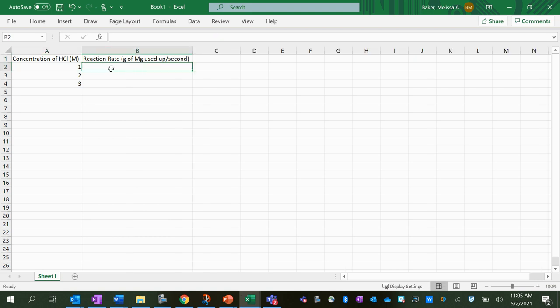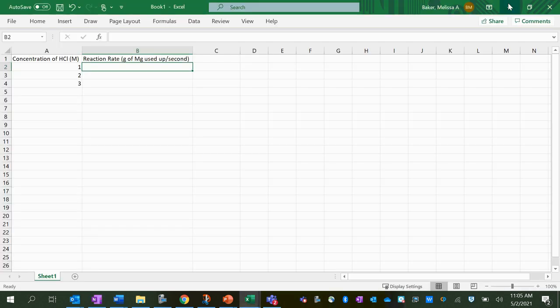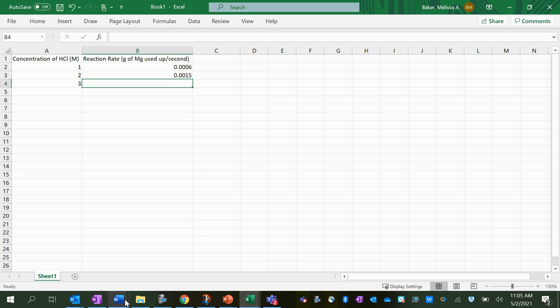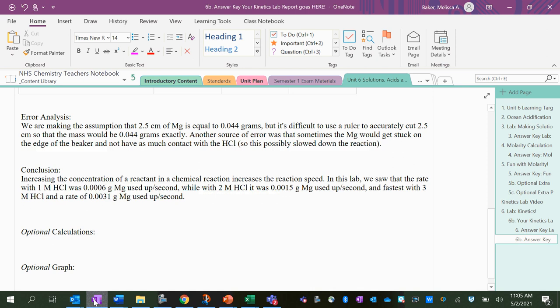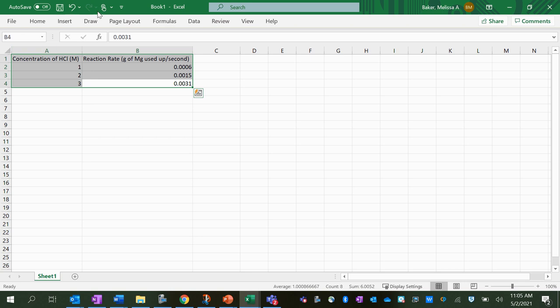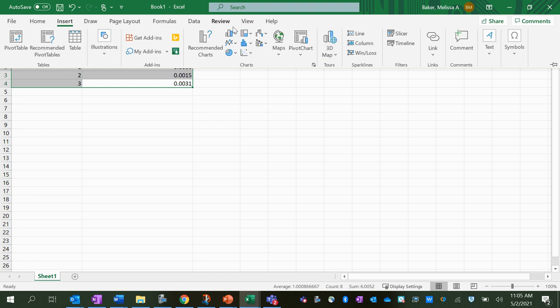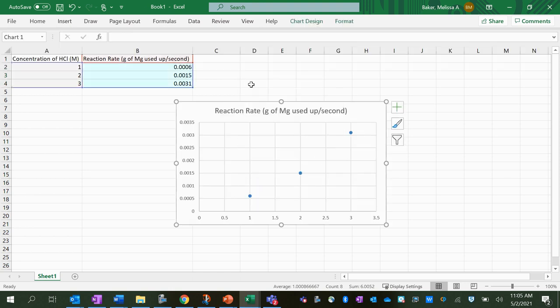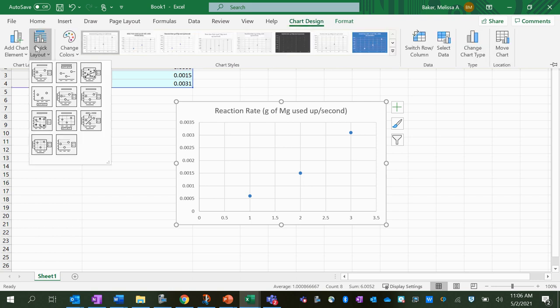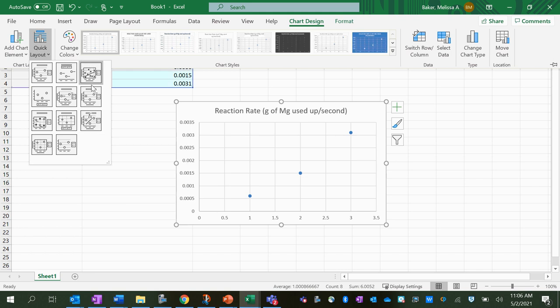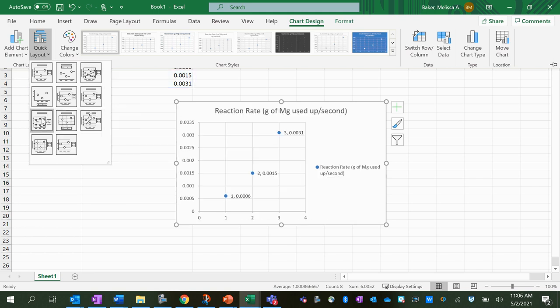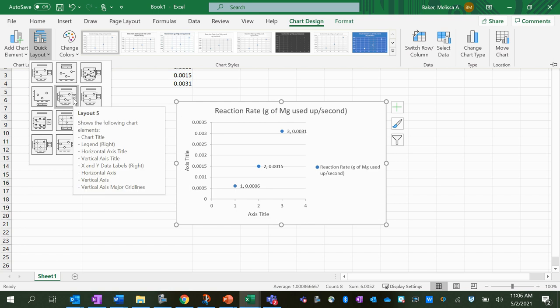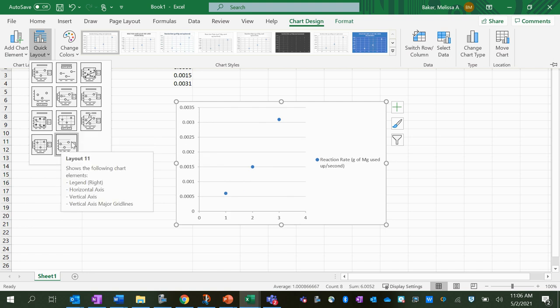And what were these numbers here? Let's see, 0.0006, this was 0.0015, and 0.0031. Okay, so I'm going to highlight my data and I'm going to go insert. We can use the scatter plot—this looks good. And then how do I get it so that there's axes? Let's see, chart design, quick layout. Definitely want one where it labels the axes.